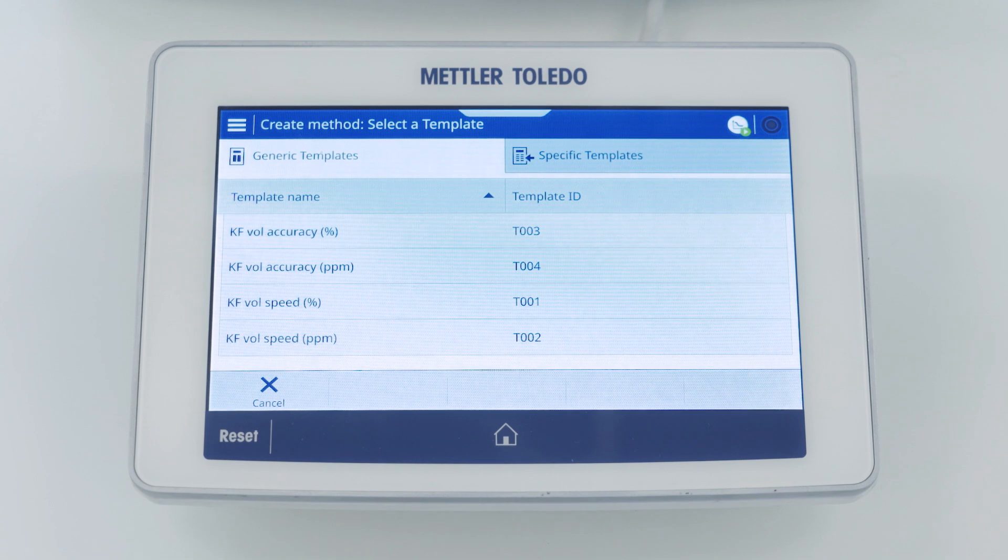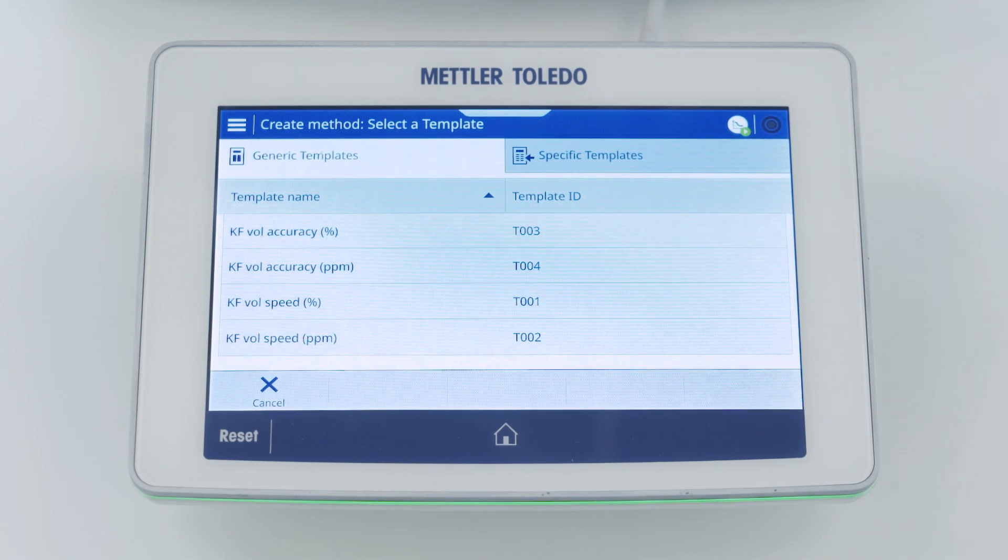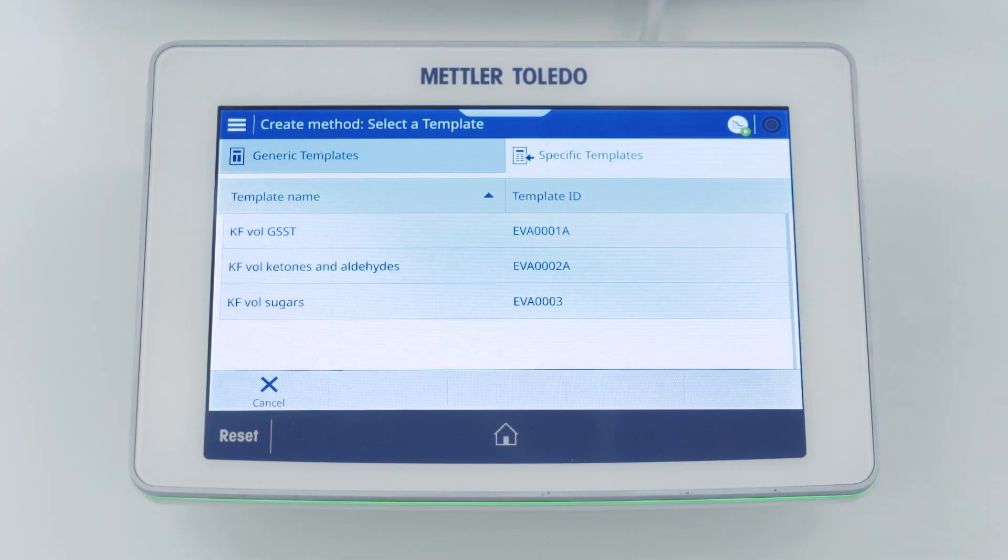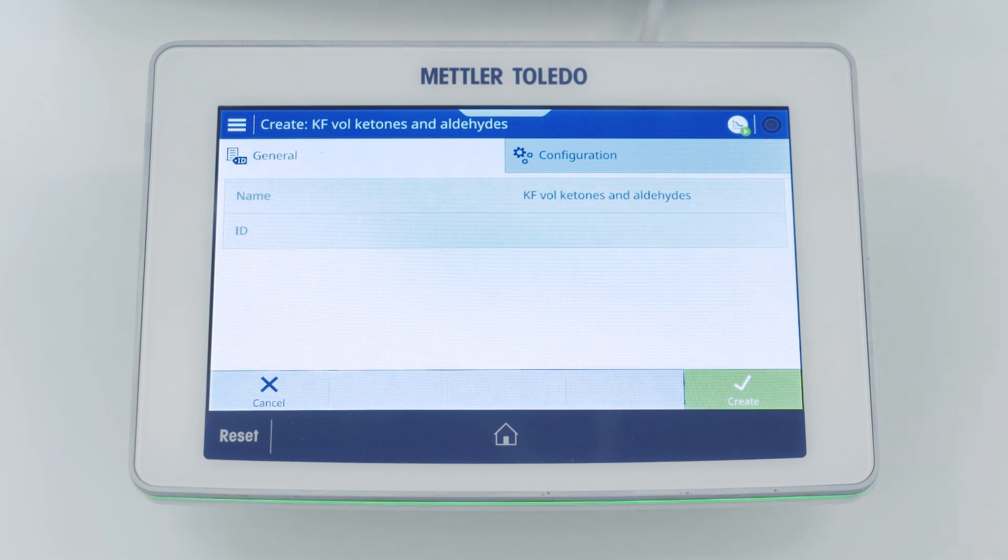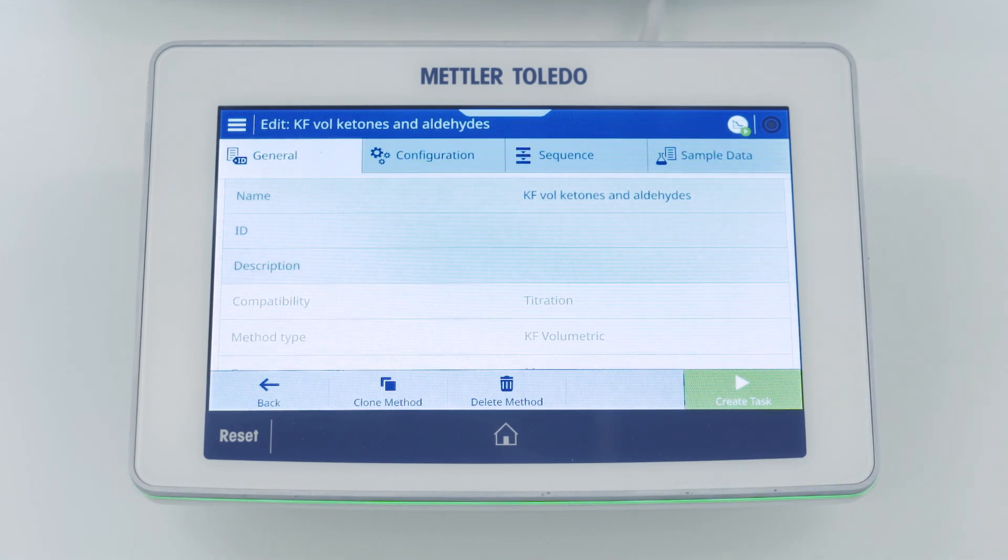All the methods are based on templates. Under specific templates we find a dedicated template for ketones and aldehydes which we're going to use. If we open the template all the parameters are pre-adjusted and the method will be ready to use. So we just create the method based on this information.